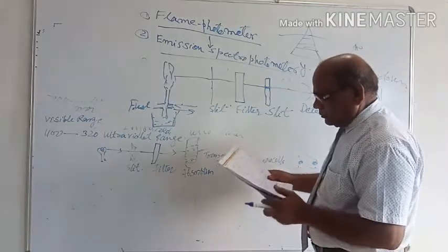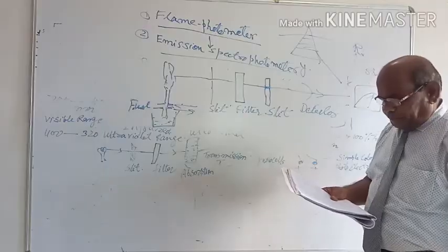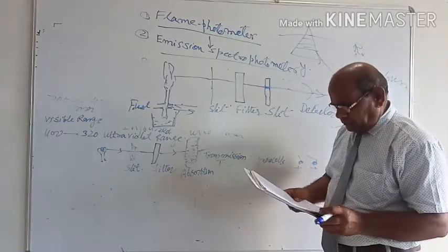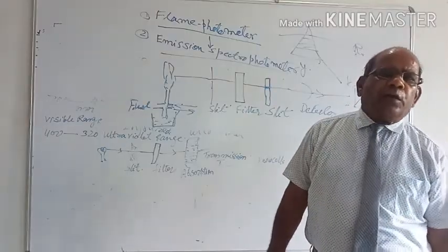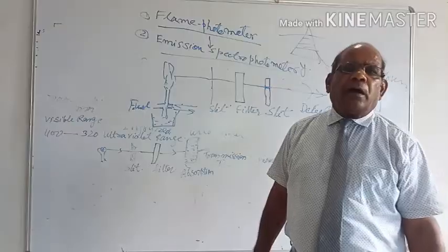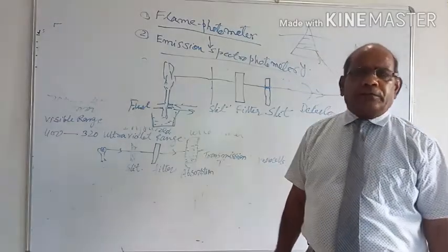Now, flame photometry, the source of light. Flame photometry is especially used for the estimation of sodium and potassium, and on request it is also used to estimate lithium.